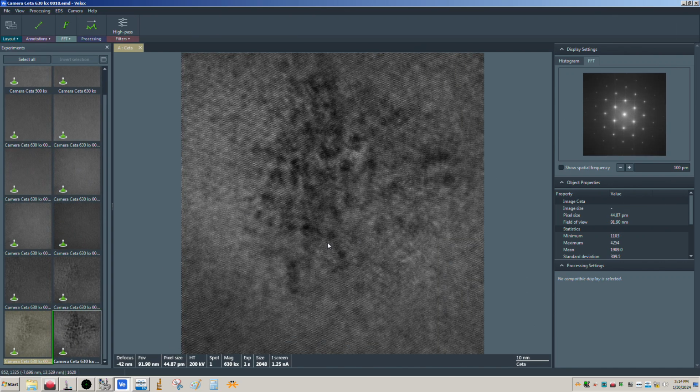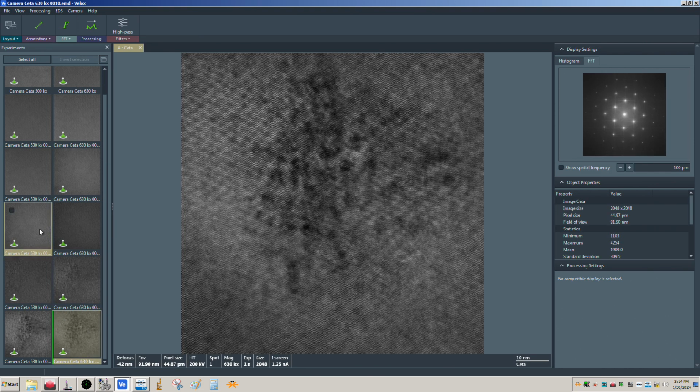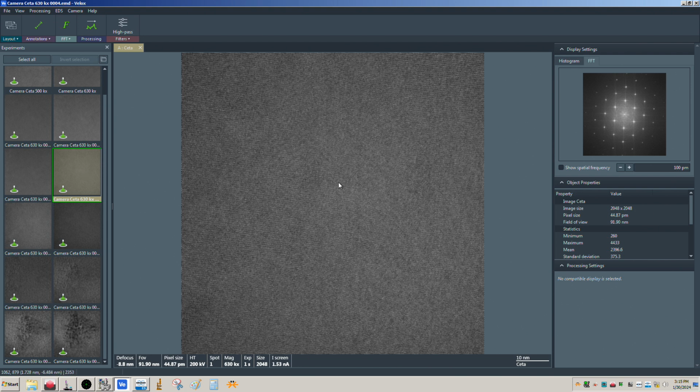I thought it would take not as much time, and not with the beam being that close to or that converged to see it. But I mean, you can see it, right? Start to finish. Okay. Now again, this was with the lower dose here. Okay, before we did anything, and we've taken a bunch of these images here.